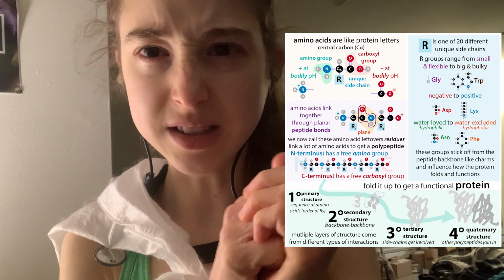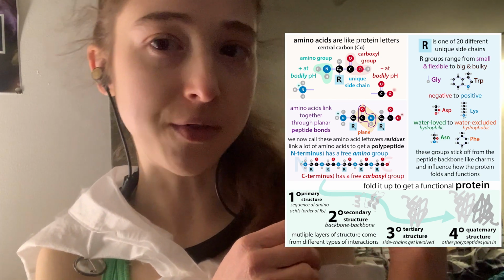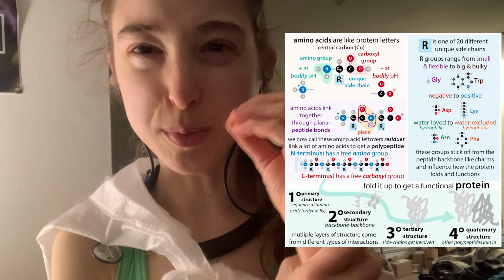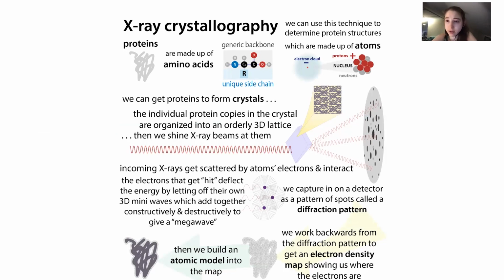Not that it's the researcher's fault or anything, it's just that certain regions of a protein might be more flexible and moving around, and this is going to make it harder to get super tight data for that region. So a basic overview of X-ray crystallography is that we take some molecule that we want to figure out the structure of. This is often a protein, sometimes a protein and some nucleic acids, so like DNA or RNA, sometimes nucleic acids alone, but we'll talk in terms of proteins.